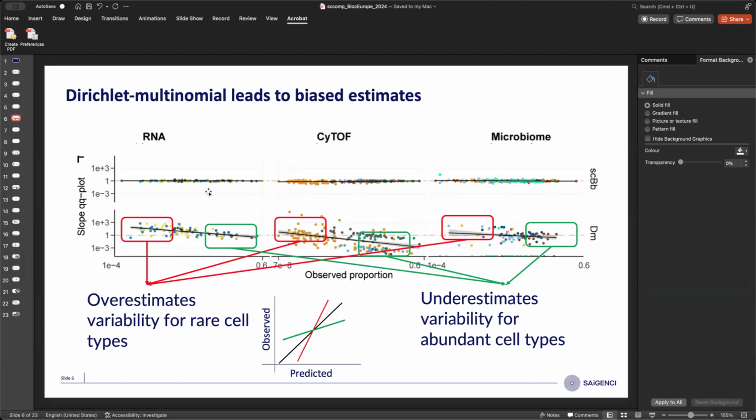Here we take real data and model this data with different distributions, and then given that model, we generate the data back. So what you would hope is that the model generates data with similar properties, for example, mean and over dispersion. So the model is descriptively adequate for your data. What we have done here is to get observed data and predicted data and do an empirical QQ plot. And you hope the regression line would have slope 1.